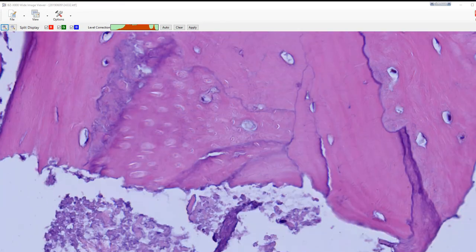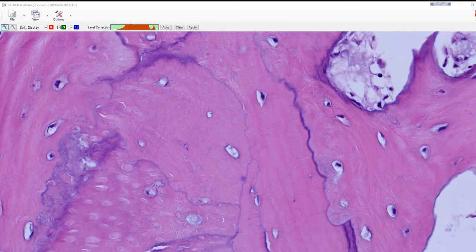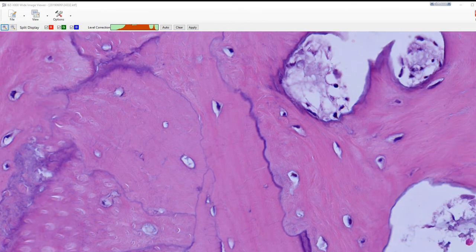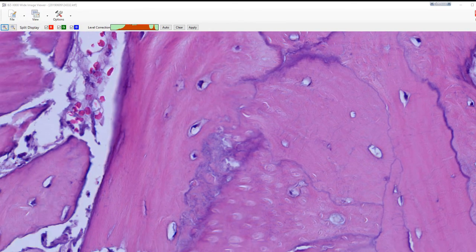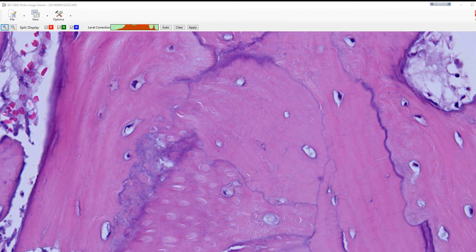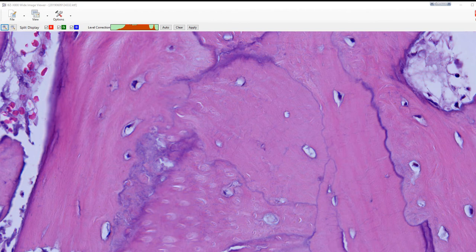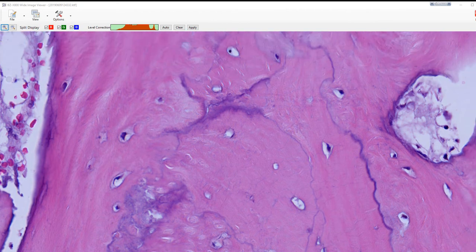And because I can zoom in so far, I'm hoping the segmentation software will really be able to produce a very good 3D model of this.